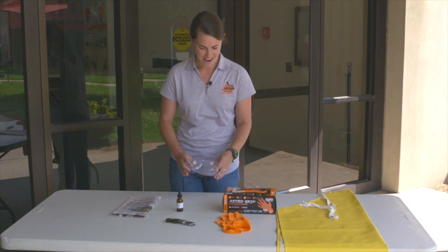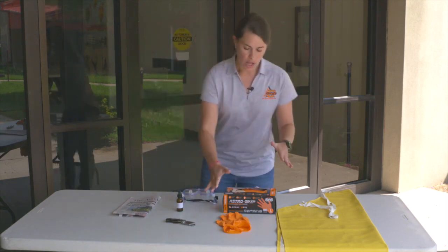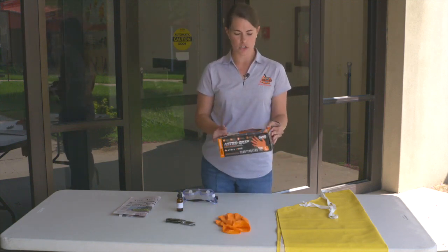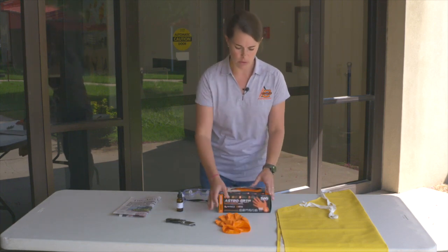We want you to protect your eyes. Goggles are important, or some sort of sunglasses or that sort of thing. Gloves, of course, we would encourage you to have. I keep a box of these in my office so we can grab them easily — you use them for a variety of things. Gloves are very important to use.